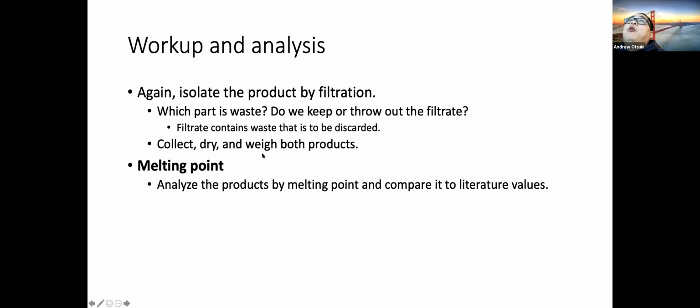You're going to learn how we first prepare a sample for melting point, and then you're going to see the apparatus we use to monitor and record the melting point. In chemistry, things have gone more technically advanced. We have very nice instruments now that record the melting point automatically for you, so you don't have to stand there and watch it melt. But you should monitor it when you're doing these things in the lab.